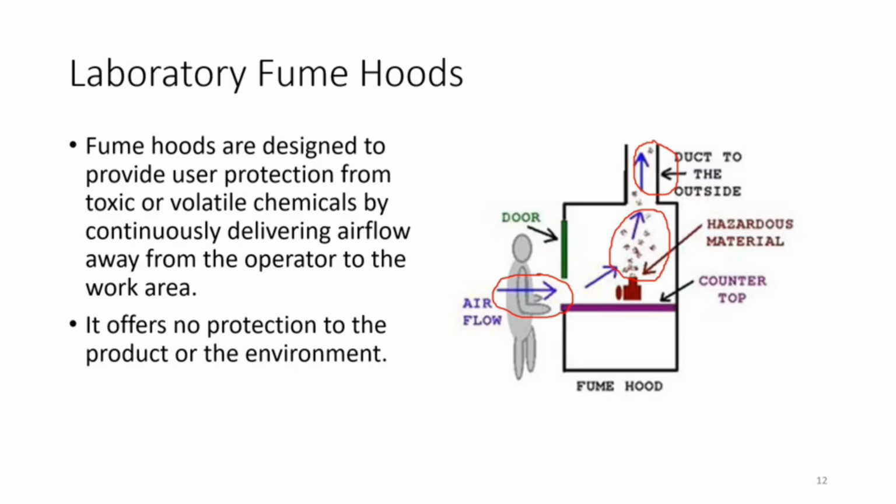But we say that the fume hood doesn't offer protection to the product or the environment. This is because when the air flows from the environment, it is not being filtered. Hence, maybe the air is dirty, but it will just come into contact with your product in the fume hood. And it doesn't offer protection to the environment as well, because whatever fume exiting the fume hood is not being filtered as well, so it will just enter into the surrounding environment.